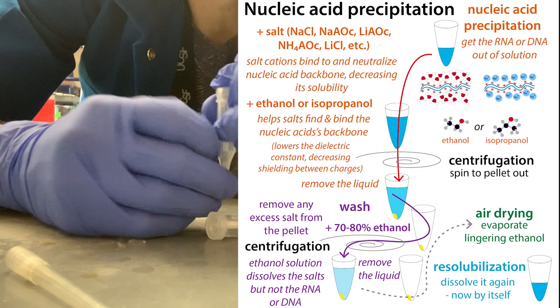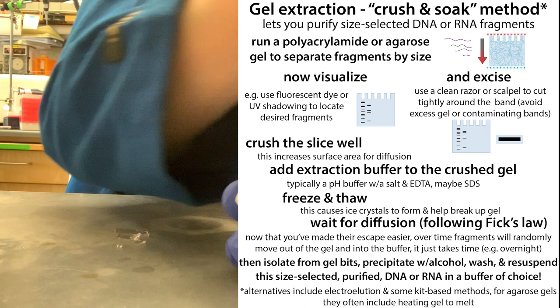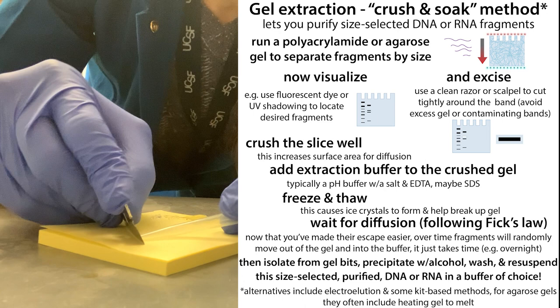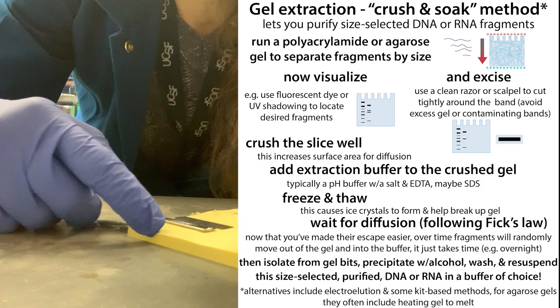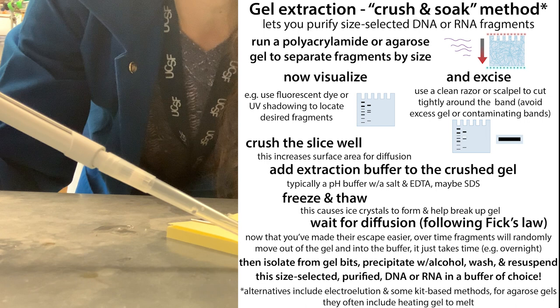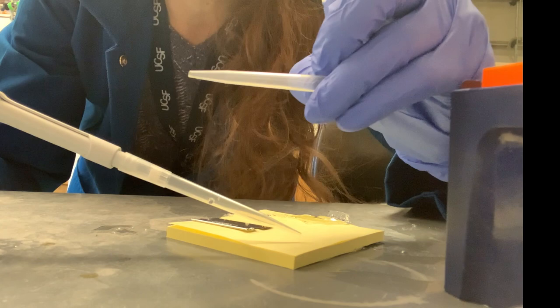You can't use a normal pipette tip to pipette out the sample because the gel will clog it immediately. Instead, cut the tip off one of your pipette tips using a clean razor blade on a petri dish or similar surface, giving you a wider opening so you can pick up the gel bits. If you have many gel samples at once, cut all the tips you need and stick them back in the box so they're easy to grab — just make sure you know which ones are already cut.